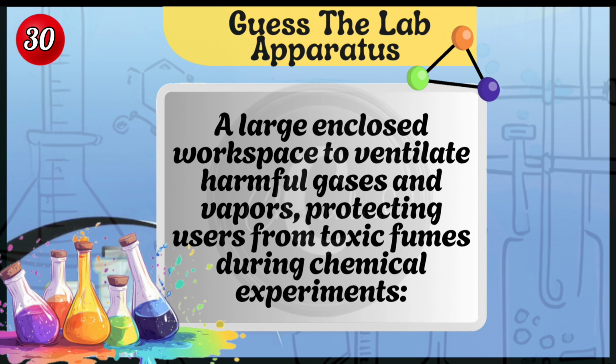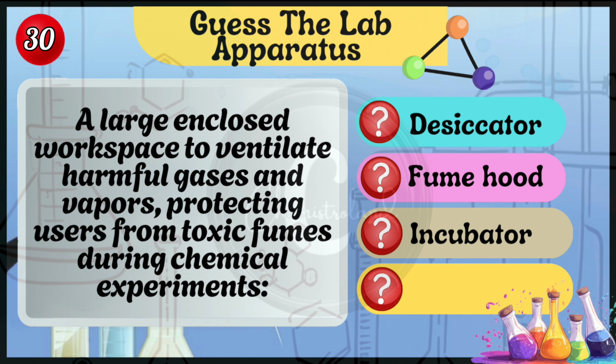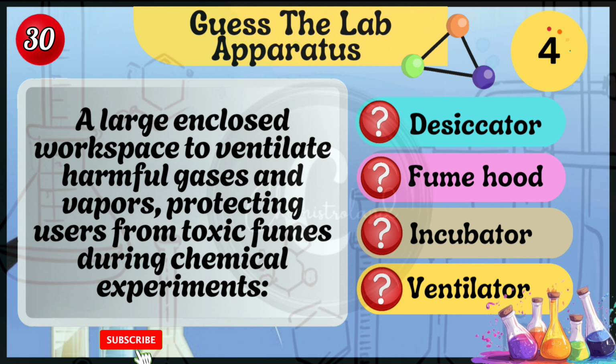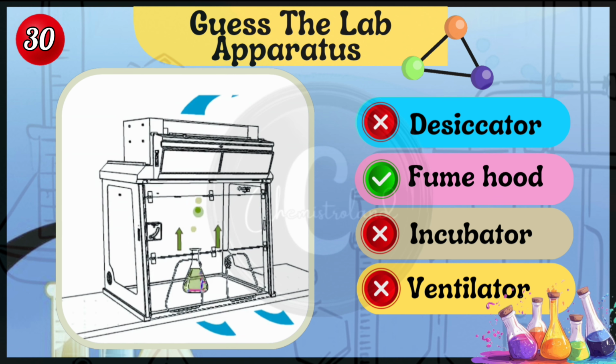A large enclosed workspace to ventilate harmful gases and vapors, protecting users from toxic fumes during chemical experiments. Options are desiccator, fume hood, incubator, and ventilator. The right answer is fume hood.